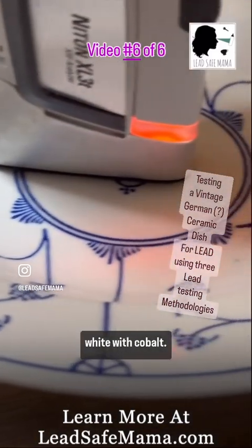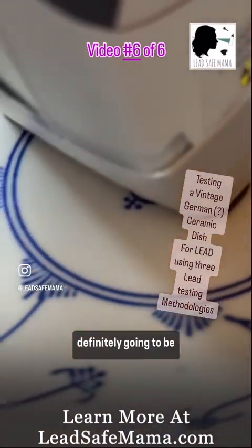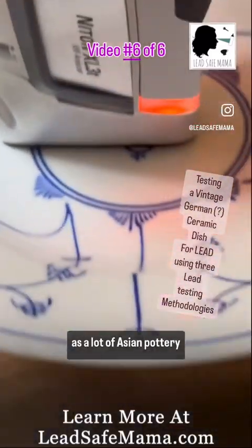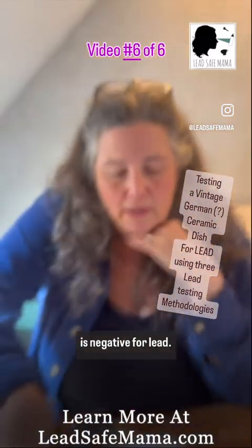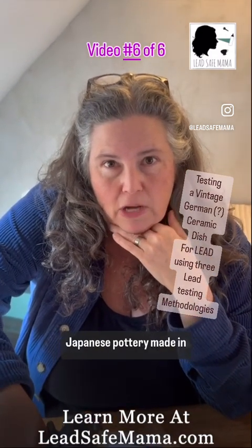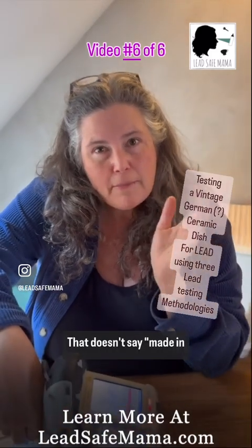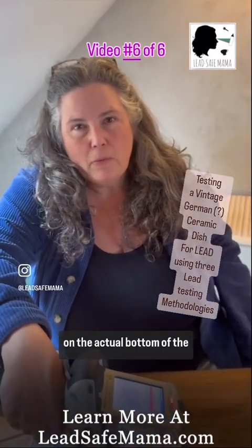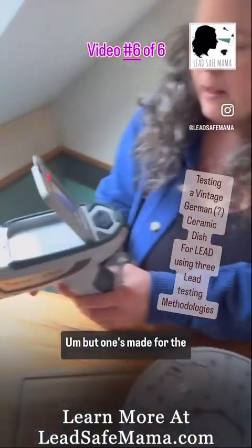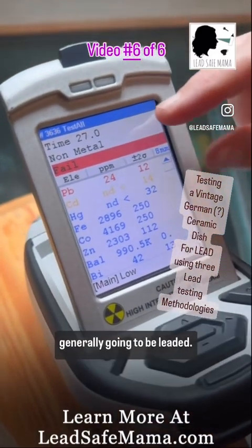The interesting thing is it's white with cobalt. There's no cream in the white, so a lot of people are going to think it's definitely going to be negative for lead. It may be negative for lead, as a lot of Asian pottery with the same color scheme is negative for lead. Chinese, Korean, and Japanese pottery made for those markets — made in Korea, made in China — without 'made in China' in English on the bottom are generally going to be free of lead. But ones made for the American market that say 'made in China' on the bottom are generally going to be leaded.